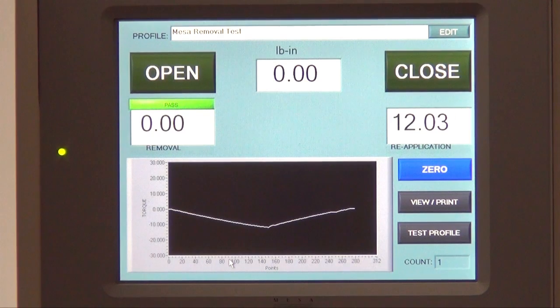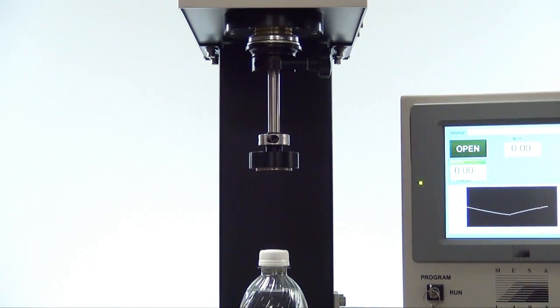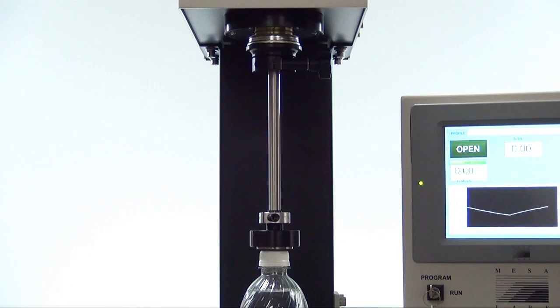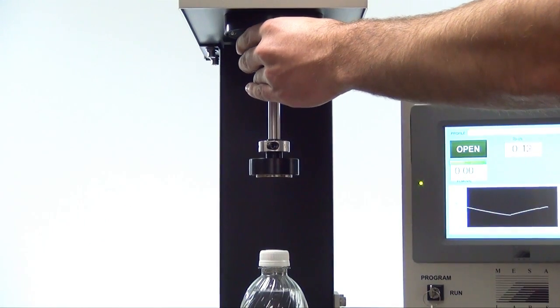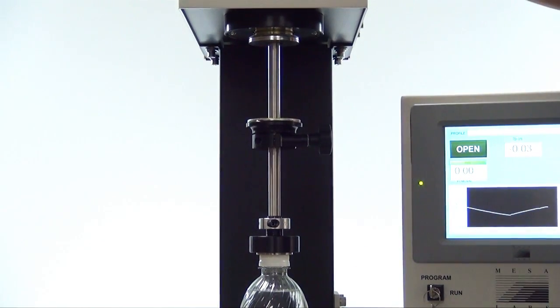You are now ready to put the chuck onto the bottle cap. You can engage the cap onto the chuck in two ways. First, release the lever by turning it counter clockwise and let the D-shaft slide down onto the cap. Second, pull on the magnet located on the top of the D-shaft and let it slide down onto the cap.